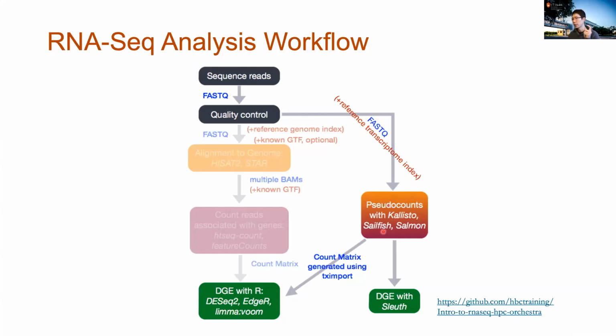And the pipeline we're introducing today is mostly on Salmon. So it's an alignment-free pipeline. Somebody calls it pseudo alignment. So basically it means it doesn't involve the alignment process, so it doesn't really map the reads back to the genome.